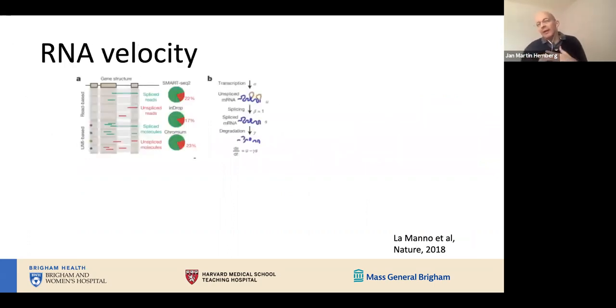These pseudotime methods really only work for one-dimensional or lower-dimensional structures when you have a few branching points, but they don't really apply to big clustering studies.